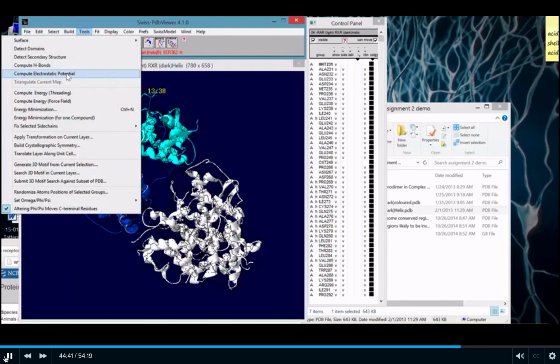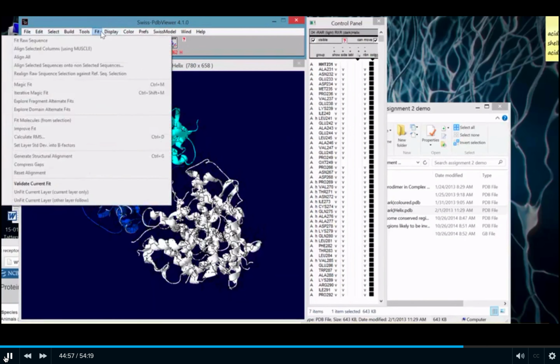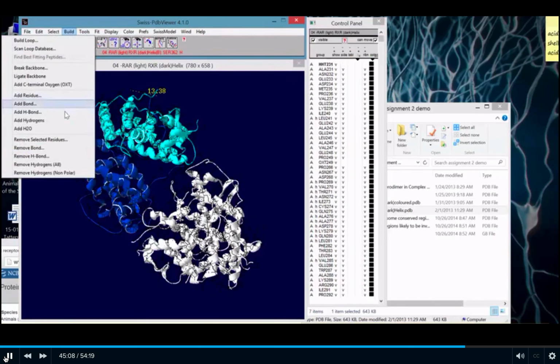If you're looking to change an active site to make a protein more stringent or less stringent, you're either going to dramatically change the charge or the size of that area, in which case you could then look at the overall surface charge. There's a whole bunch of different things here that we can look at. And again, we can calculate surface charge, we can look at different fits. The idea is that you spend some time going through some of this here. But there's a number of different tools you can use. And again, look at different hydrogen bonds, look at different distances.